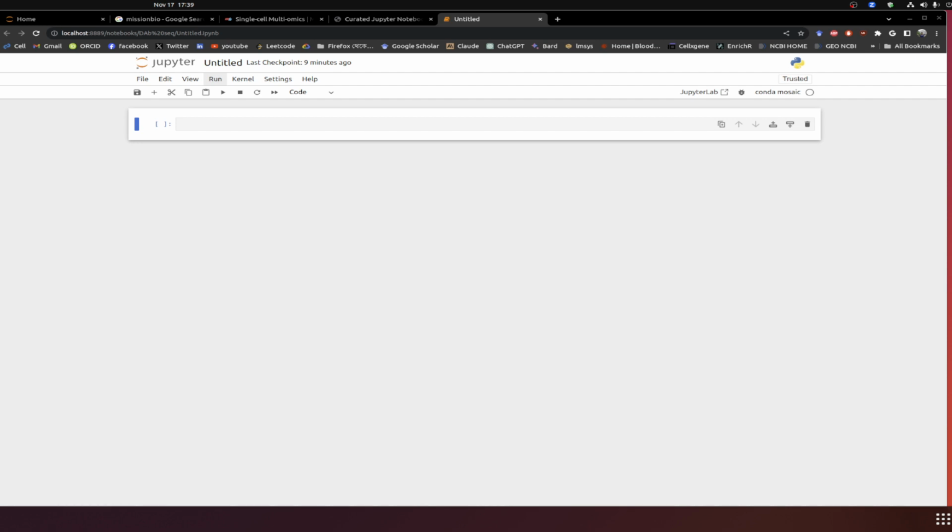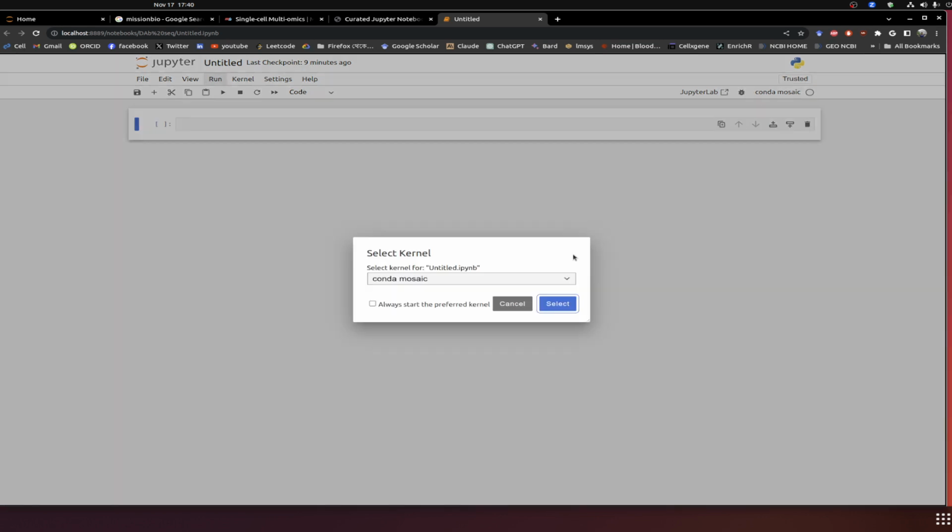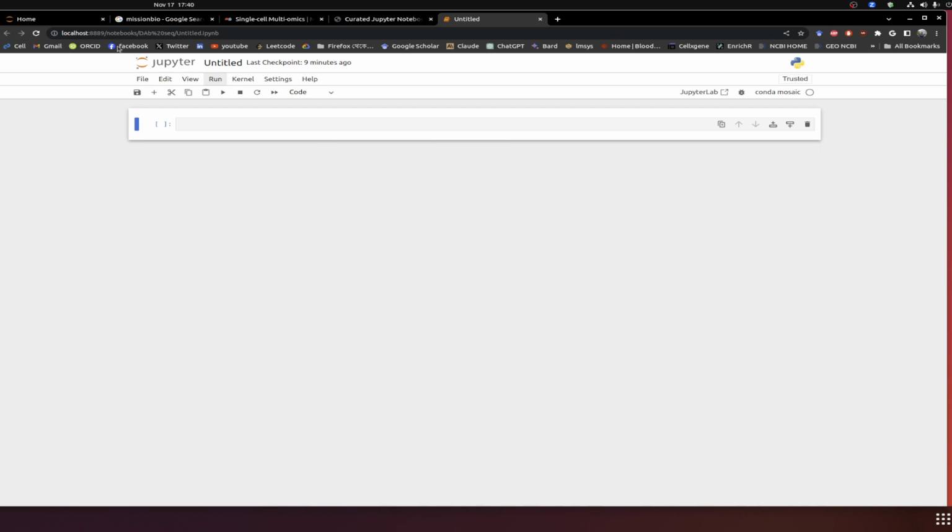In short, you create a new virtual environment, within that a new Anaconda environment, and after its activation, a specific port of Anaconda that will only open this specific environment. So you can see, out of many, this is one of them.